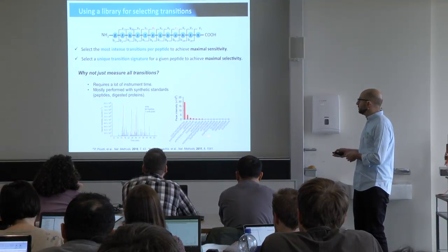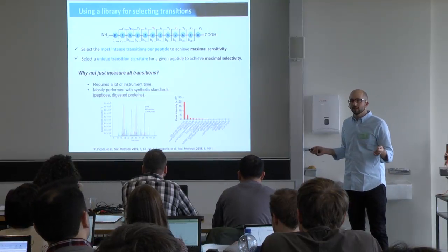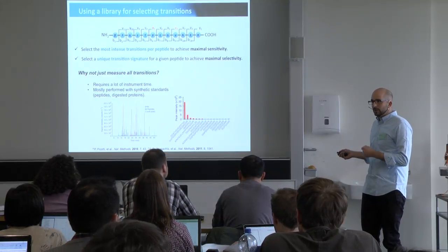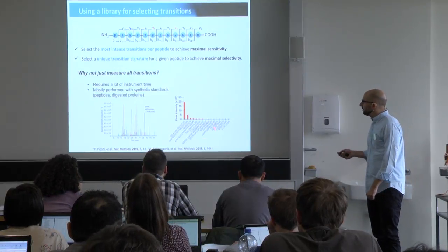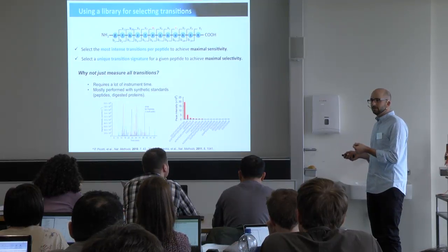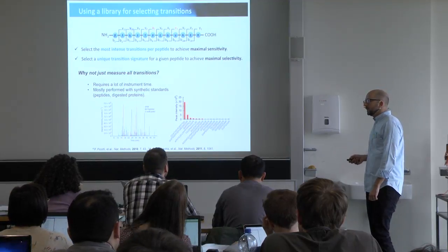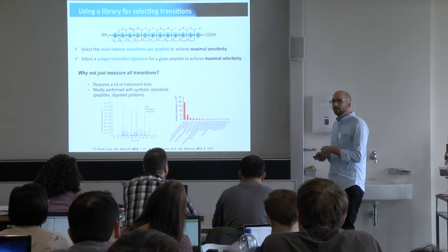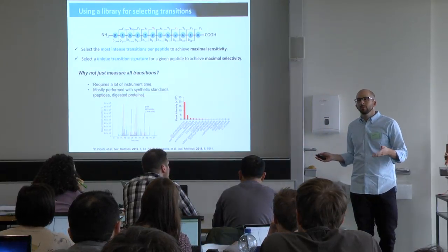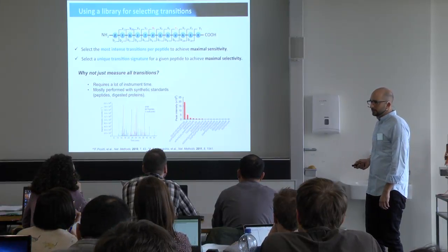Another approach that came in 2011 was to take proteins that you're interested in, express them in a certain system, digest these proteins, and then generate assays for these. Of course, the advantage when you work with a digested protein is that you get one extra level of information, and that is that you also know which of the peptides flies the best. So you can tell these peptides are the most likely to be observable from all the peptides of a certain protein sequence.